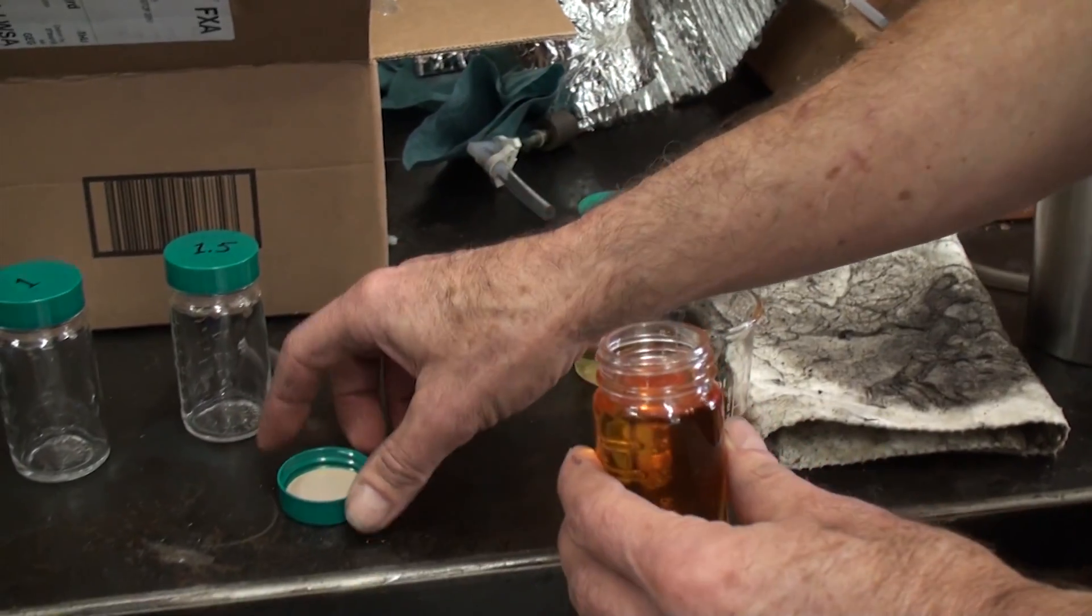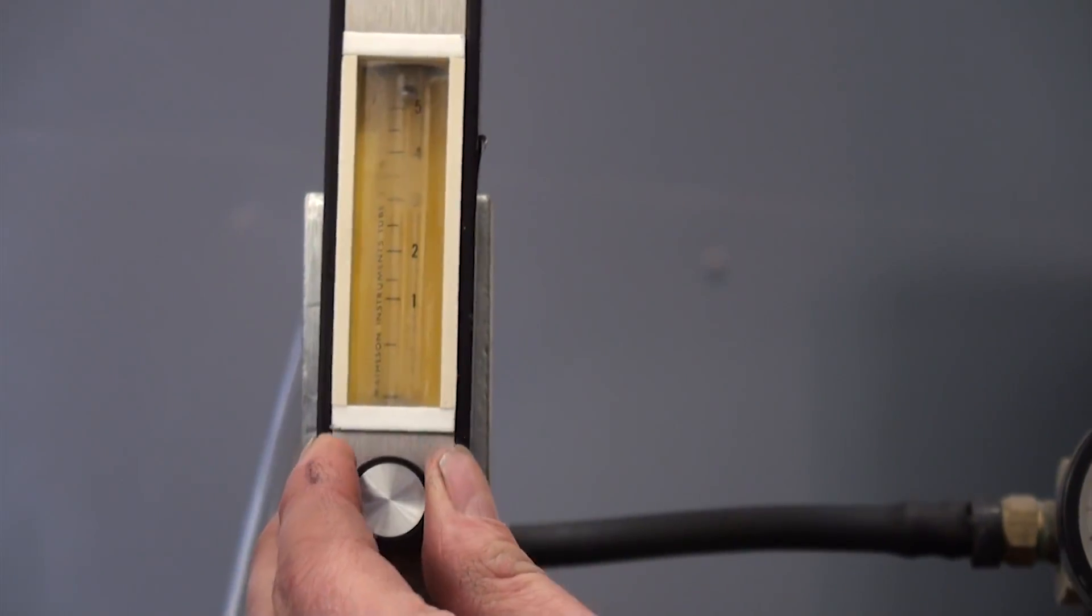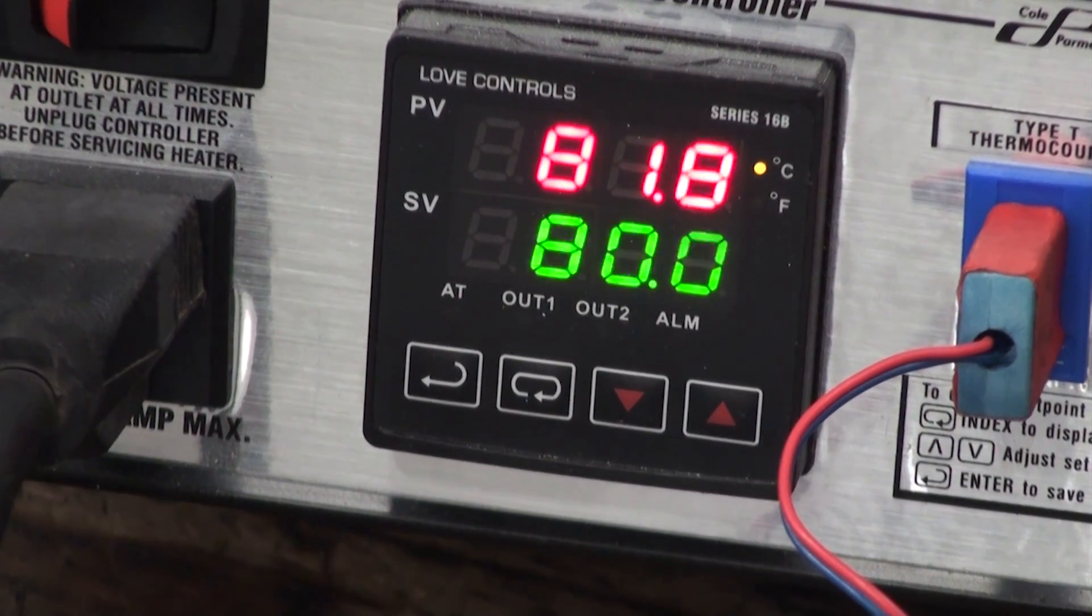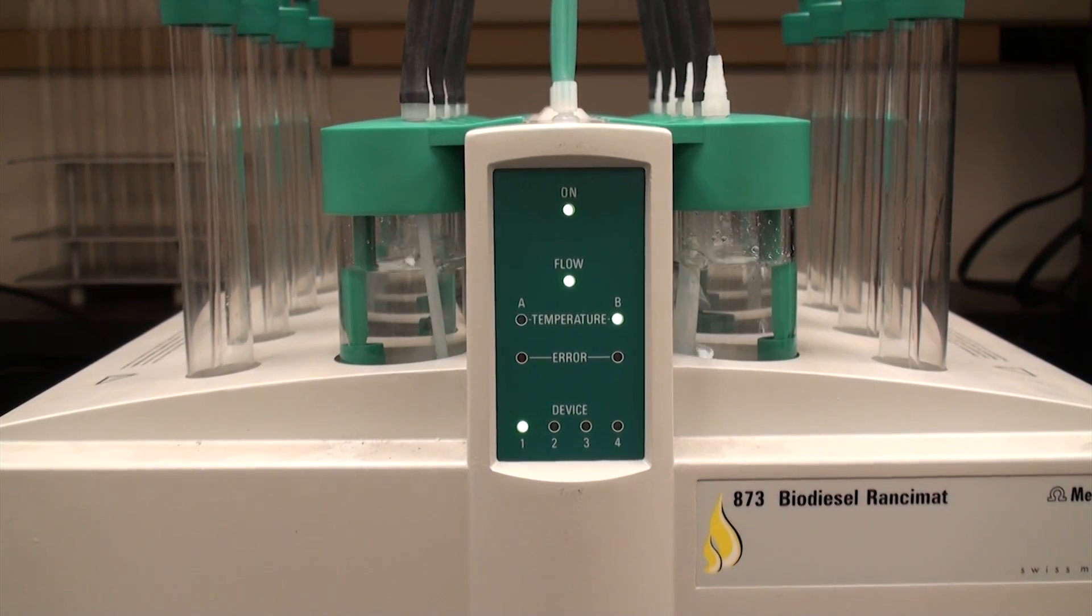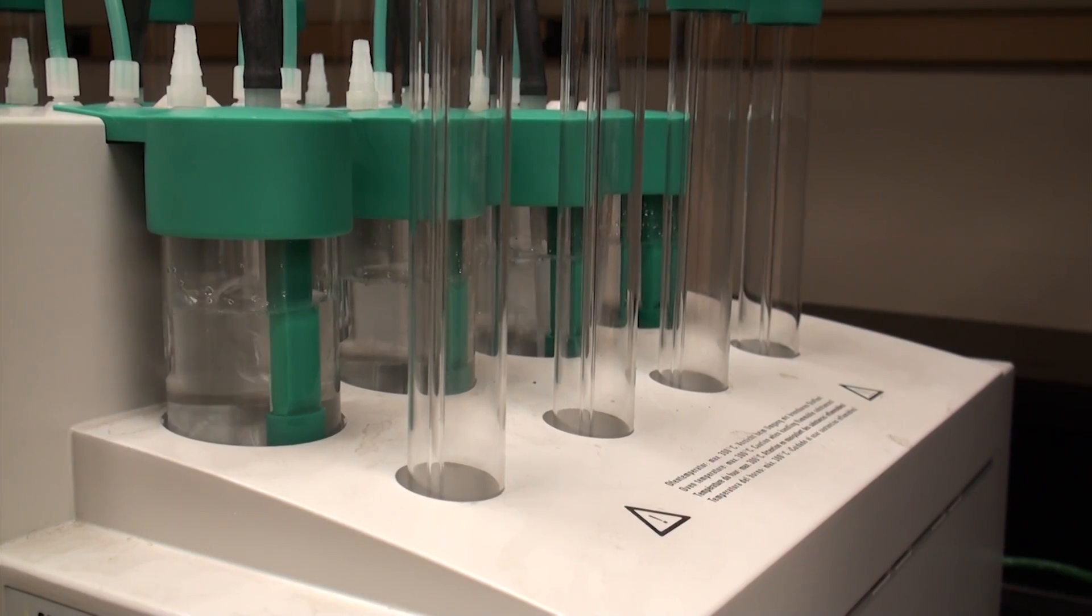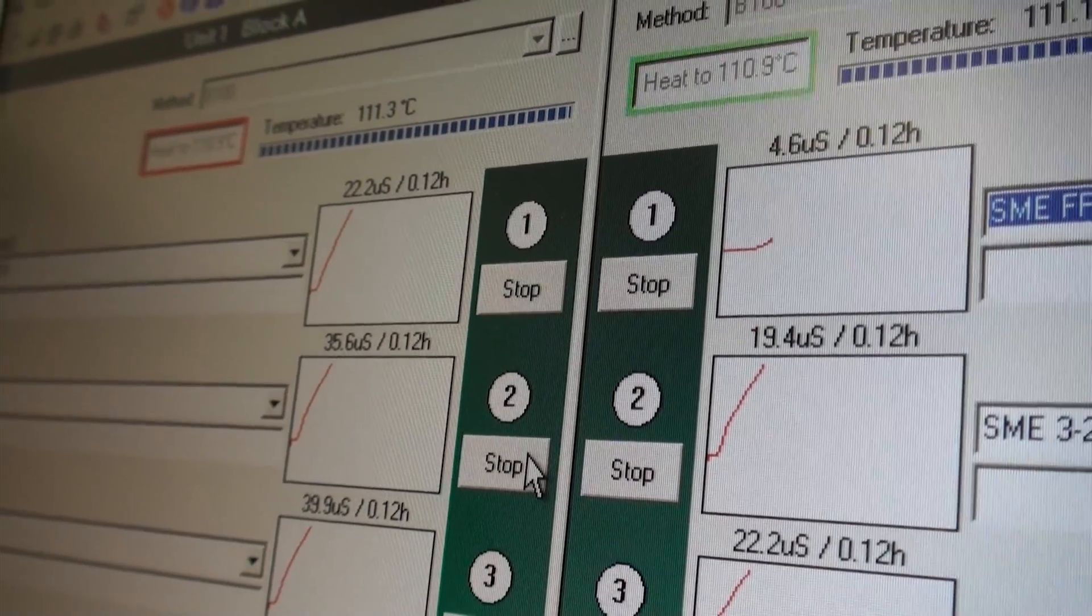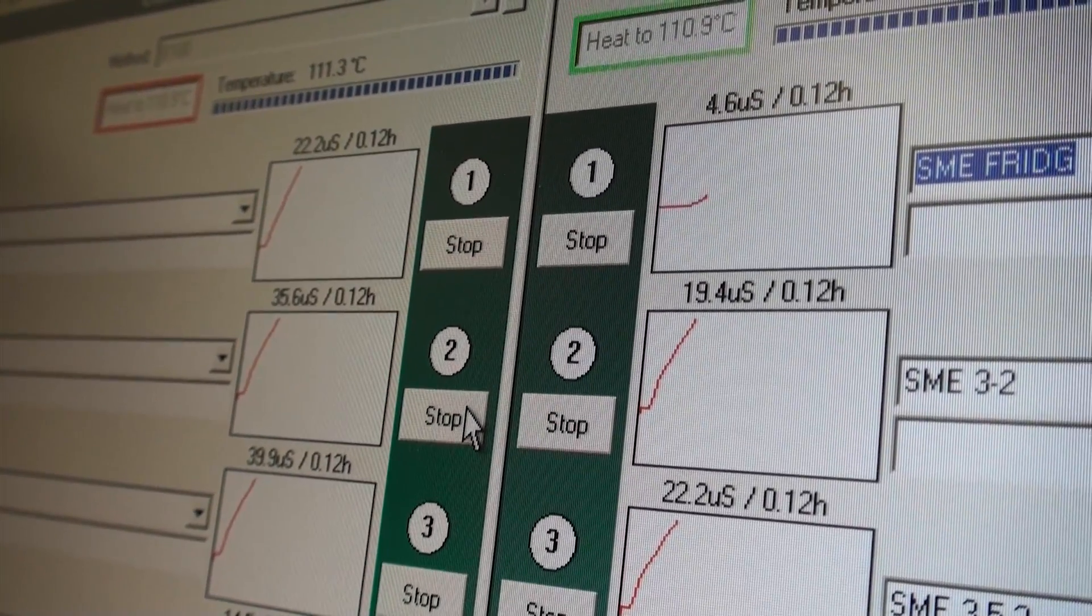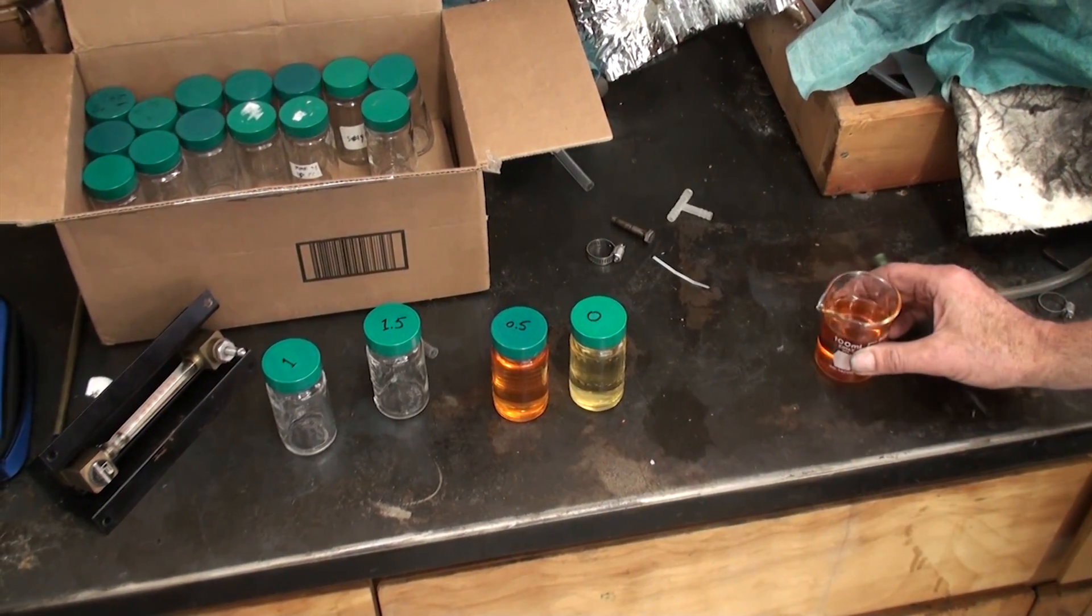We're also using it for our spontaneous combustion experiments. We're taking samples from another container that we're heating and bubbling air through, and we take samples of it every hour for a period of eight hours. Then we'll run an oxidative stability index on those samples to see the progression of the deterioration, and that gives us an indication of how far down the fuel has deteriorated and its tendency to oxidize and create heat and eventually cause spontaneous combustion.